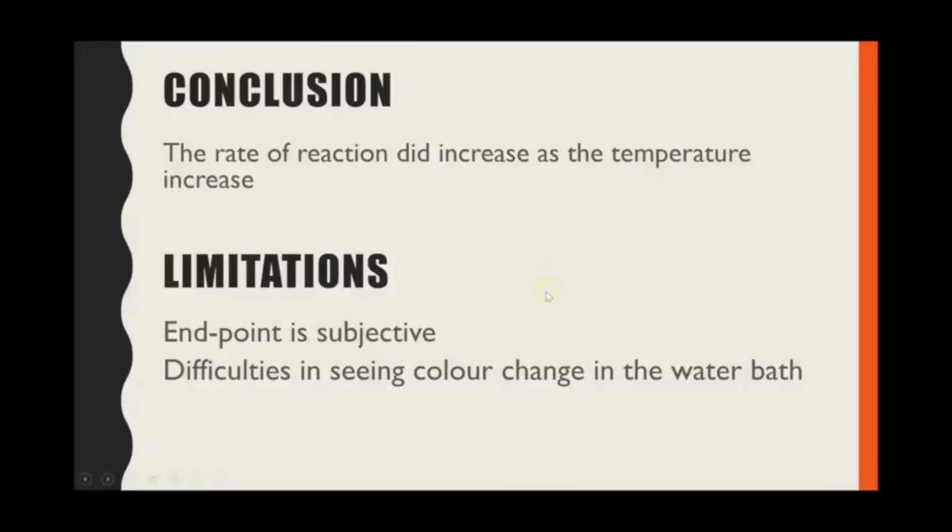There were limitations. Even though I used that colour chart to standardise the endpoint, it is still subjective. When you did this experiment, I'm sure you found that you had to ask each other, you might have debated a bit, has it reached that colour? I'm not sure. So it is still subjective, even though we've put measures in to try and standardise it.